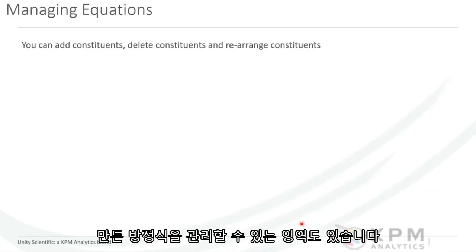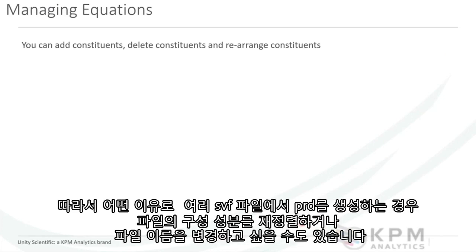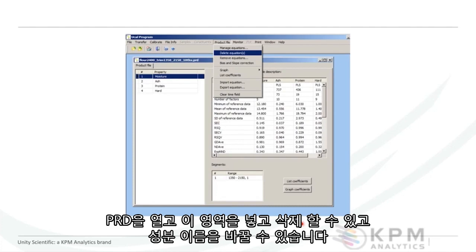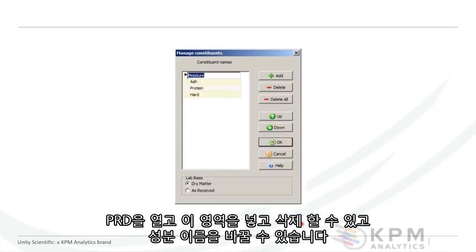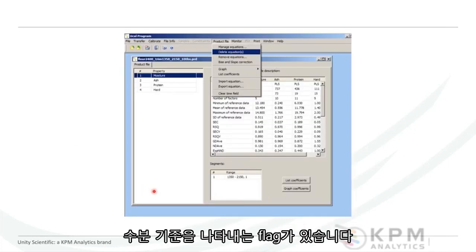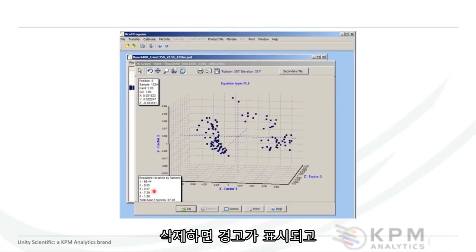There's also an area where you can go in and manage your equation, your PRD that you've made. So for some reason, if you are creating a PRD from multiple SVF files, or you want to rearrange or even rename your constituents in your final PRD file, you can do that here. You've seen this before. You open up your PRD and you've got your area. You can go in and delete. You can change your constituent names. You remember we've got a flag that indicates the moisture basis. If you delete, it's going to give you a warning.